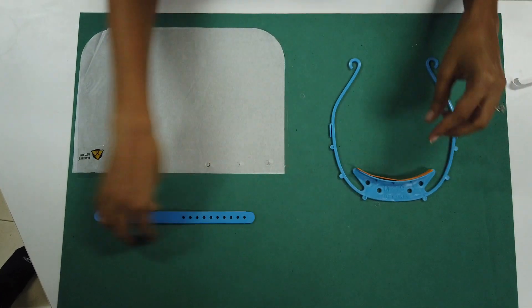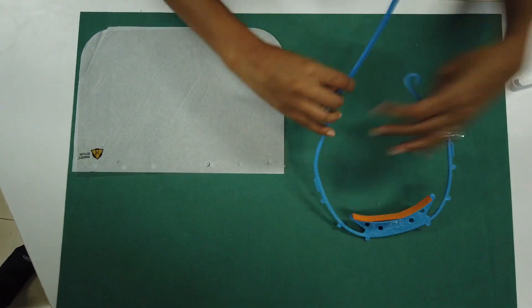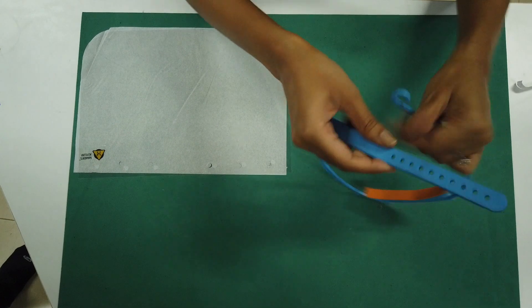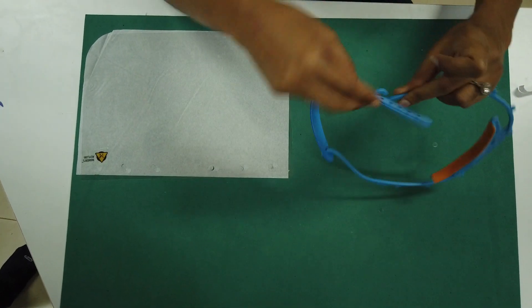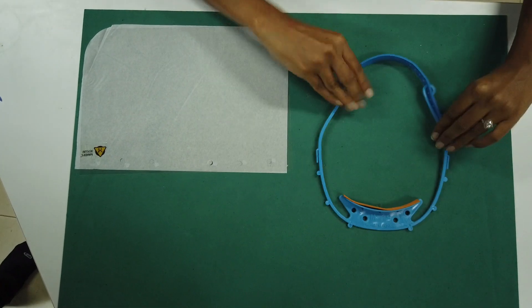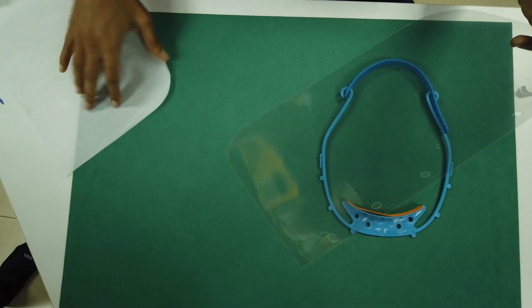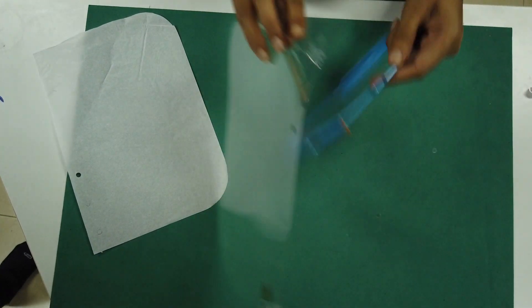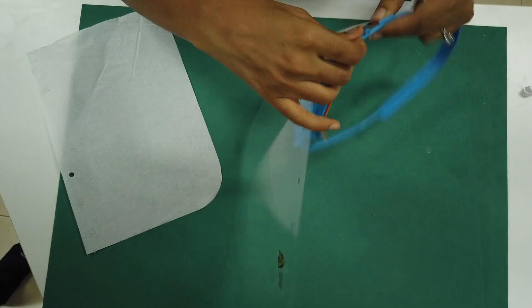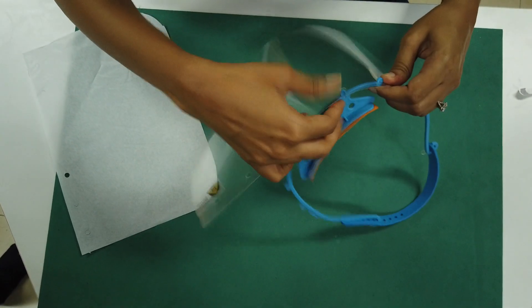Next you take the head strap and attach it to the back based on your head size and comfort. Lastly you take the replaceable visor and attach it to the front of the headband by simply pushing it on to the pegs.